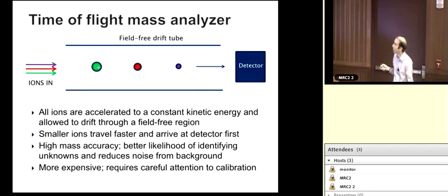So this is one metabolite here, and you can see that in this case we have a single mass, and it can break up in many different ways, and all of these different ions inside the mass spec can be detected if you have an instrument that's capable of doing it. Not only do you get the ability to distinguish two things if they fragment in a different pattern, but you also can get some structural information by looking at the mass of these fragments. You know that, okay, I have an entity that gives me something with a mass of 174, 94, 74, and if you're an experienced mass spectrometrist, or if you have access to a database, you can piece this information together and get structural information. MSMS can give you good, sensitive, reproducible quantitation under some circumstances, but it does limit in some cases the number of metabolites that you can look at simultaneously, and we'll talk about that a little bit.